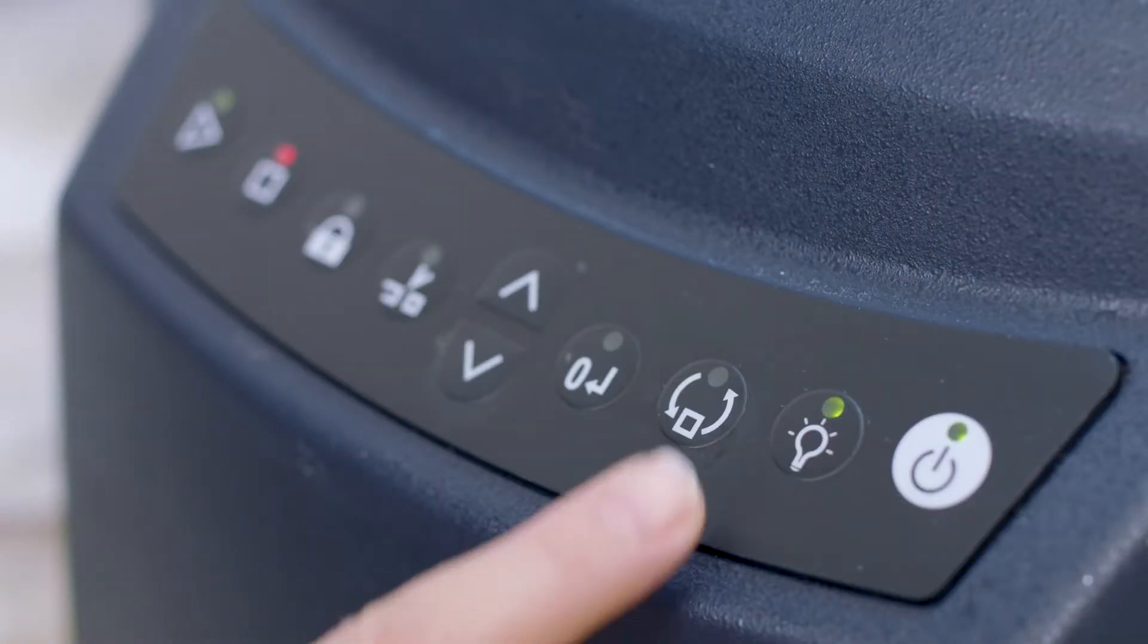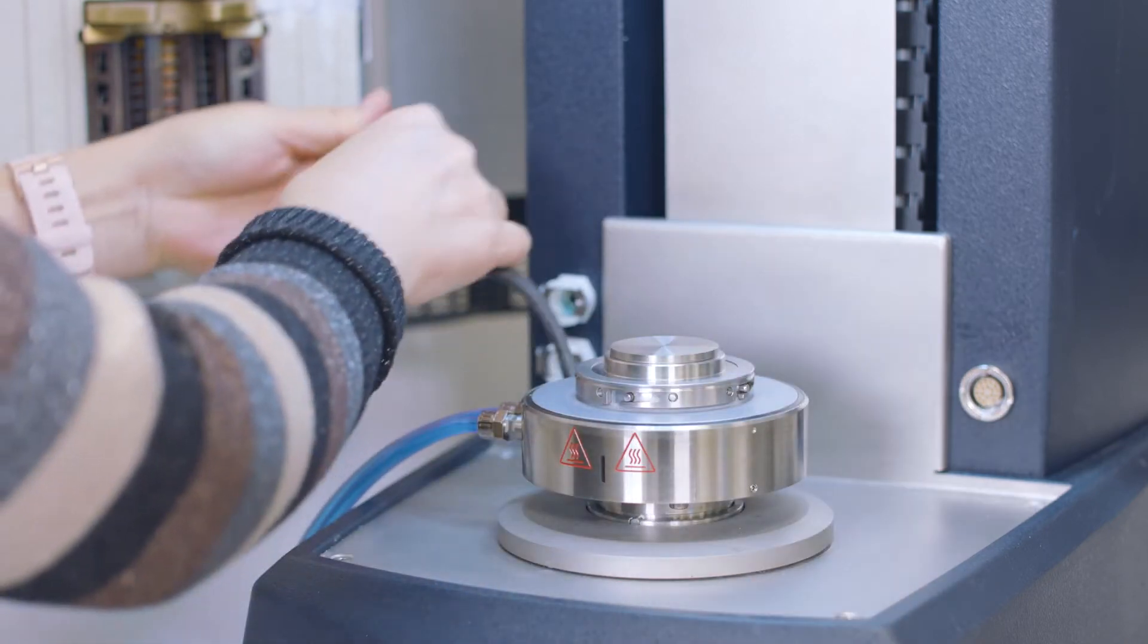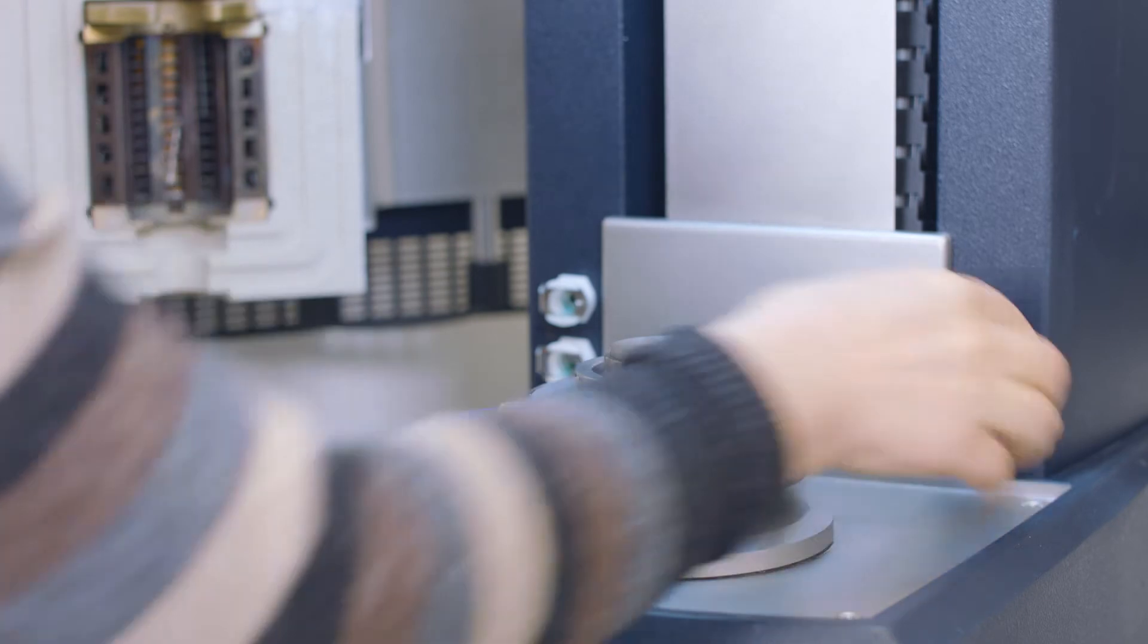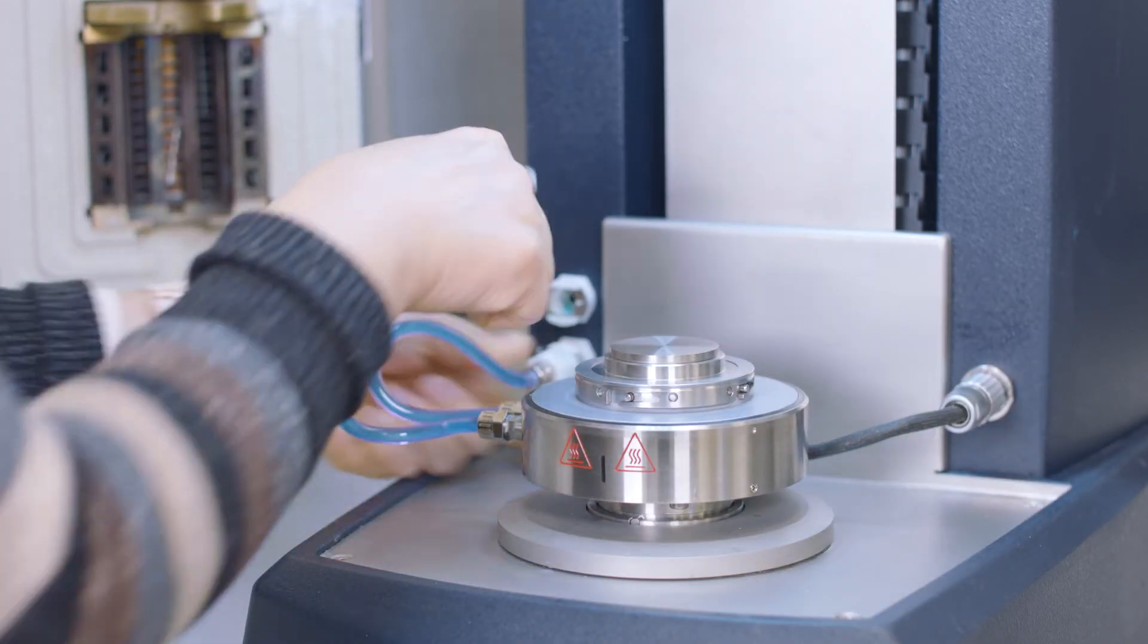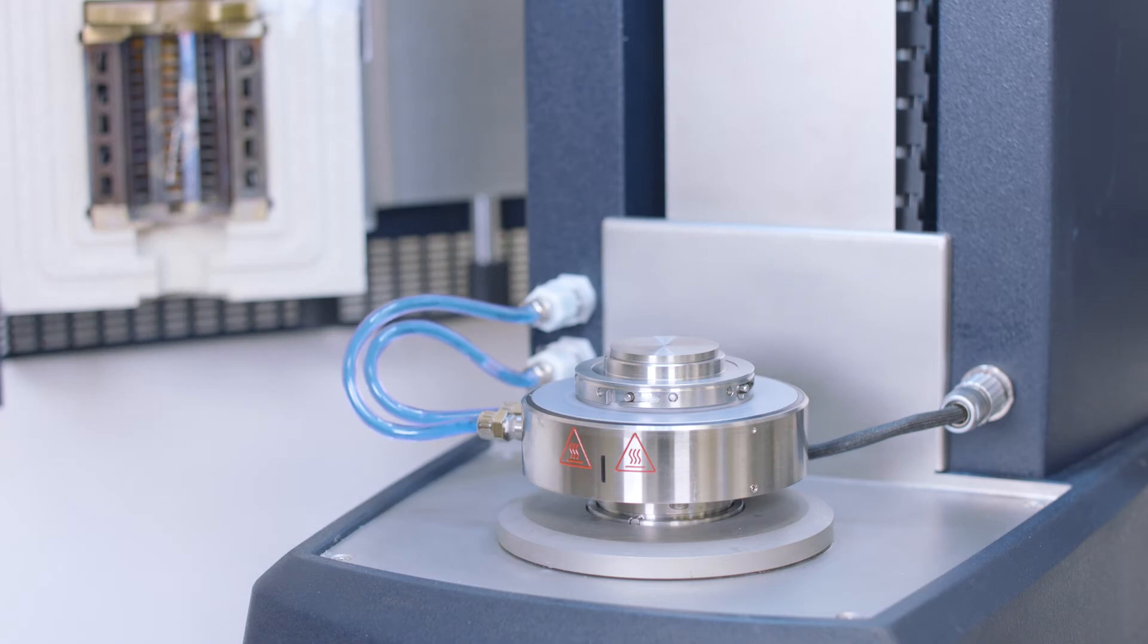From the instrument control panel, press this button to temporarily release the magnet. Put the Peltier onto the instrument bottom stage. Then, insert the SmartSwap plug with the red dot facing up. After that, plug in the circulating tubes and turn on the circulator.